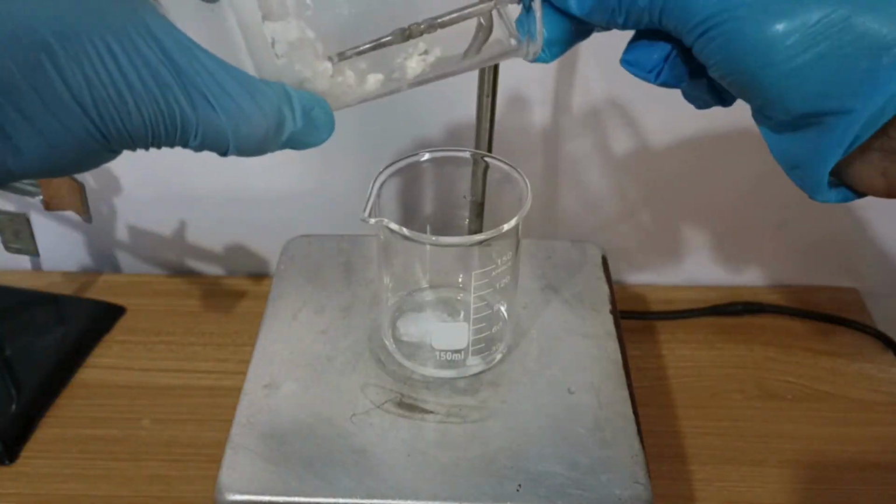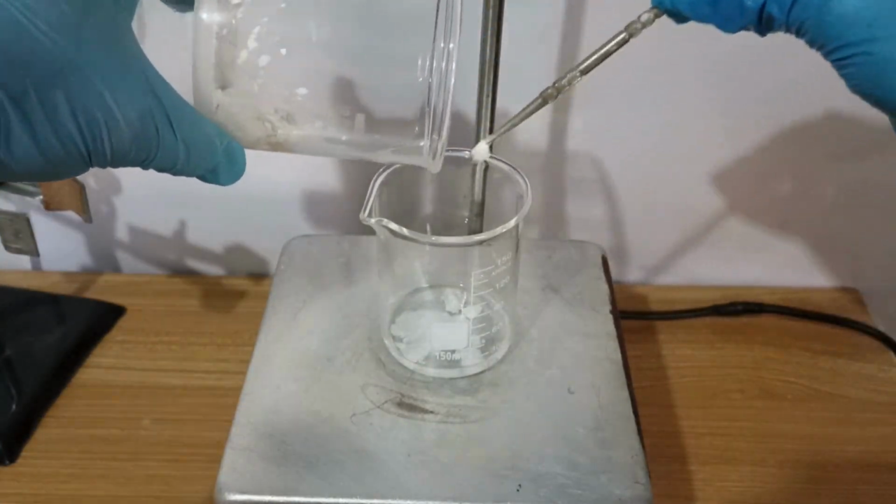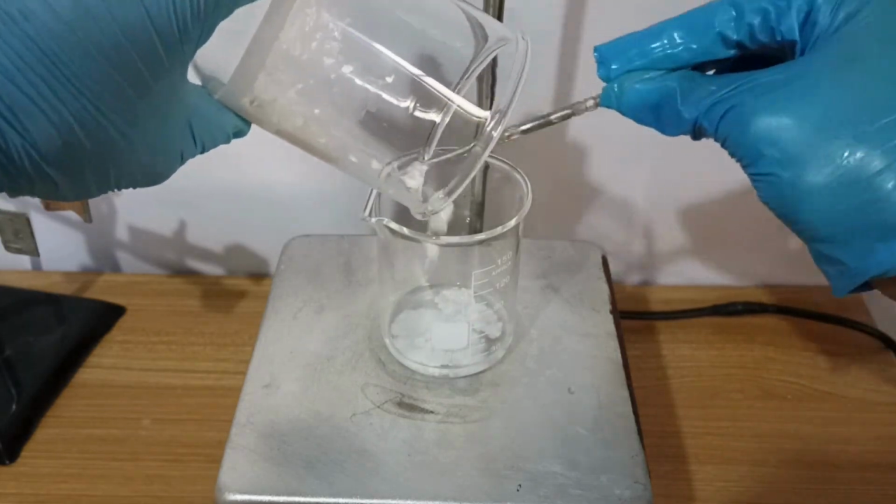To finish the synthesis, the crude phenytoin was recrystallized with 25 milliliters of 96% ethanol.